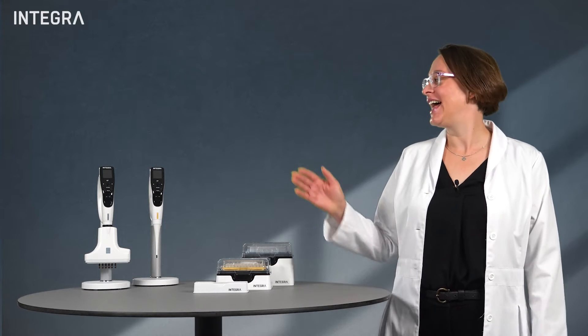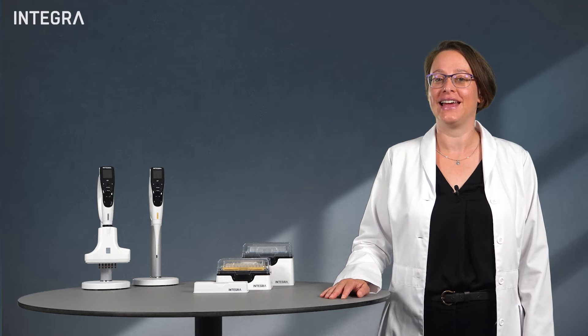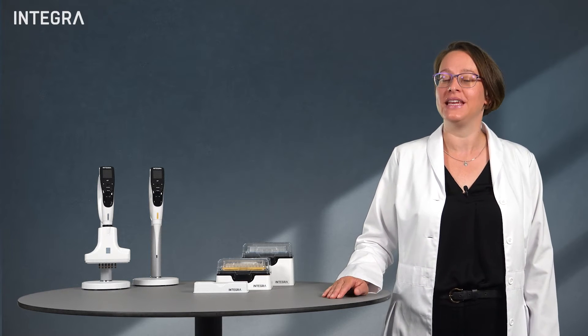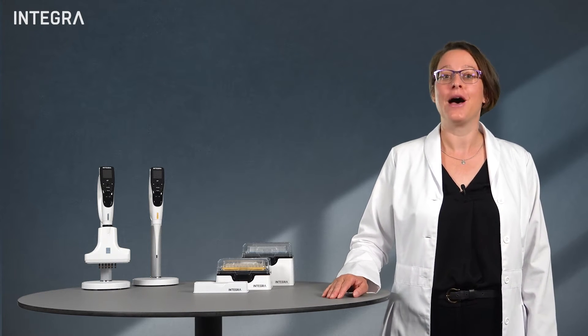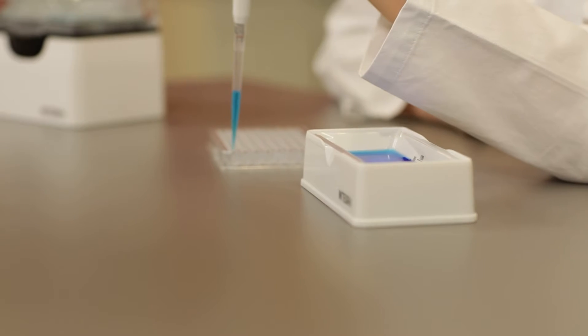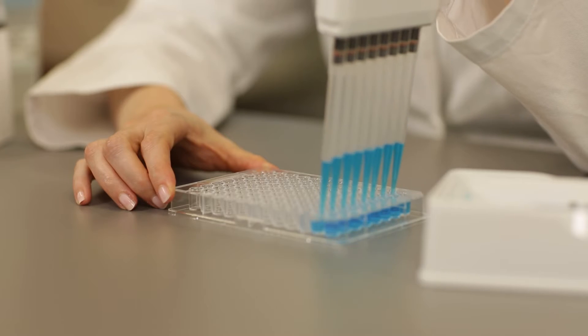Welcome back! Electronic pipettes are incredibly useful tools in the lab, and a large part of that is their ability to repeat dispense — that is, multiple dispenses after one aspiration. This really increases productivity. You can pipette faster with less errors.